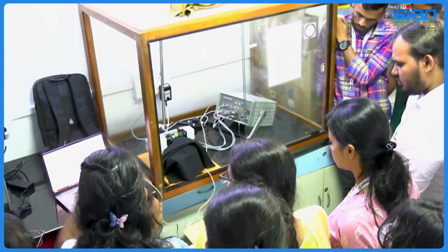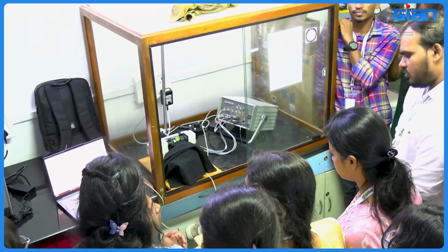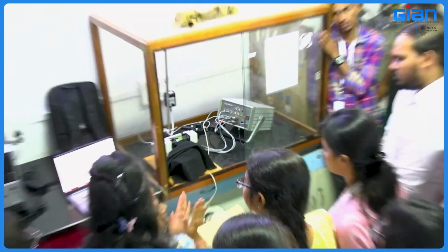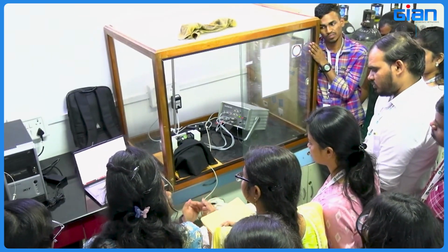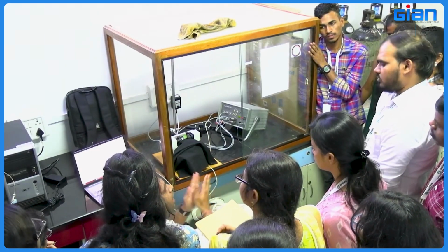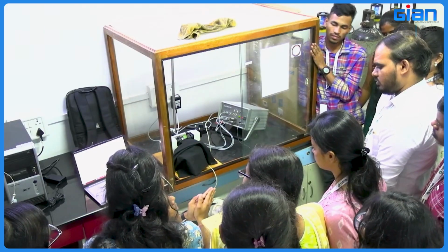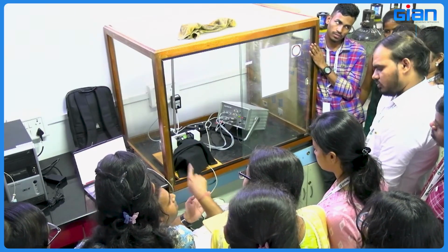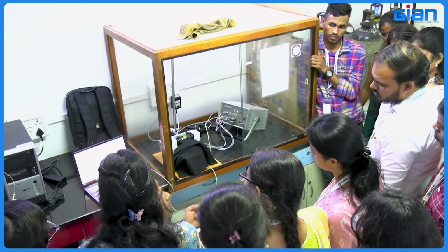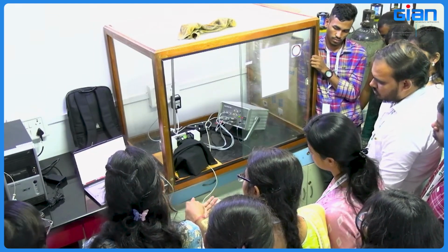Under saturating pulses, if you increment the light intensity to a higher point, then the plant's yield will drop. Any plant's yield will drop because you are giving only 30 seconds. In that 30 seconds, with every saturating pulse you are closing all the reaction centers. Then again in the lower actinic light intensity, some of the photosystems are opening again, meaning there is oxidation again. So if a higher actinic light is given along with the saturating pulse, the number of reaction centers that open may be less.